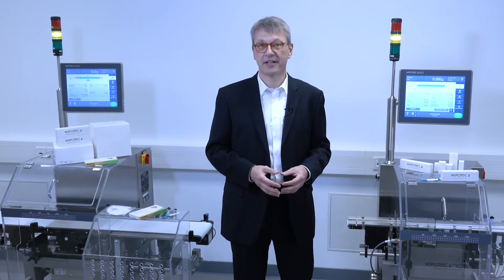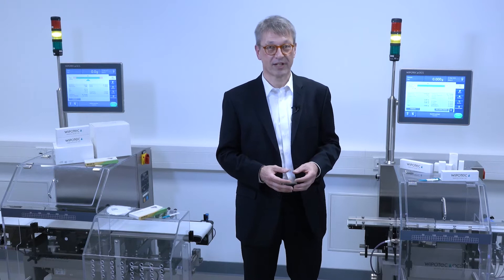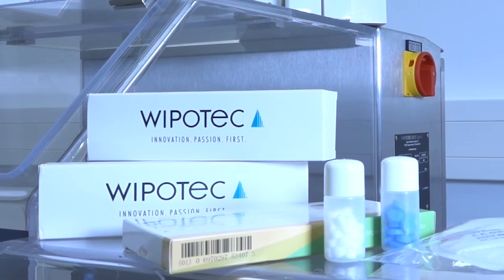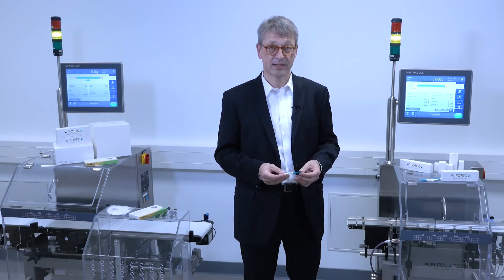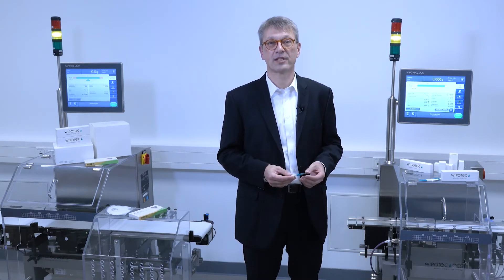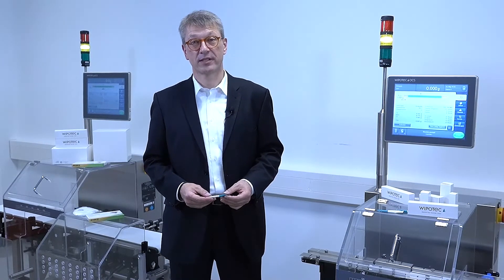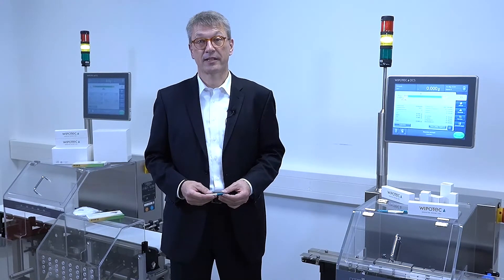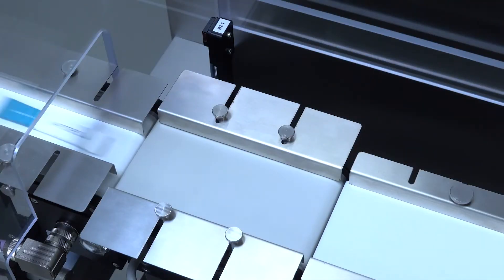We are standing here next to our HCA Mini, a checkweigher which we're using for smallest products such as stick packs, small cartons, and even sometimes bottles. Here we have special conveyors and special servo drives. The conveyors have very small product transitions because they use rollers of only 17 millimeters. 80% of the components — our servo drive and the electromagnetic force restoration weigh cells — are designed and manufactured in-house in Kaiserslautern. This is the base for precise weighing of smallest products.